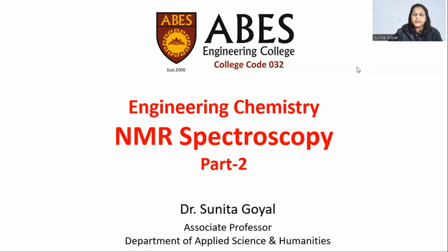Today, we'll discuss NMR spectroscopy. It will be part 2. In the first part, we discussed the theoretical concept of NMR spectroscopy, and now in part 2, we will deal with the different types of information which we can gather from this technique.